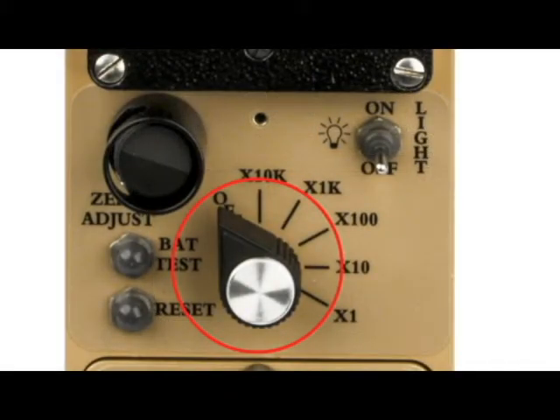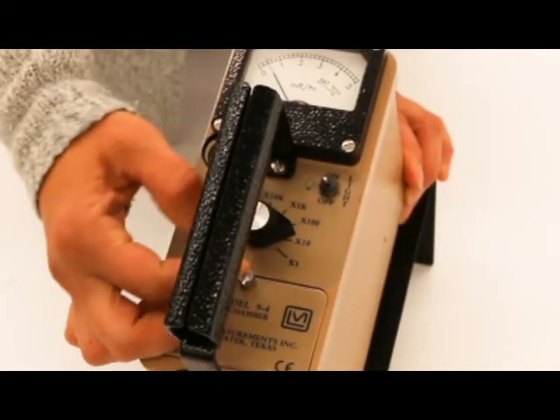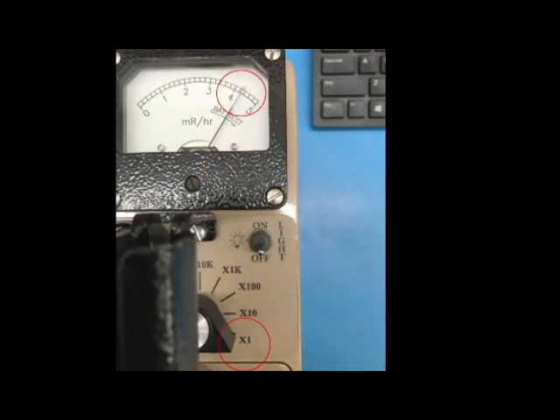The range selector switch is a six-position rotary switch. Turning it from off to one of the range multipliers provides the operator with an overall range of 0 to 50,000 mR per hour. In this example, the needle is pointed at approximately 4.25 and the range switch is on the x1 range, so the instrument is reading approximately 4.25 mR per hour.